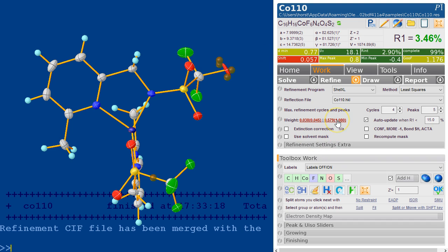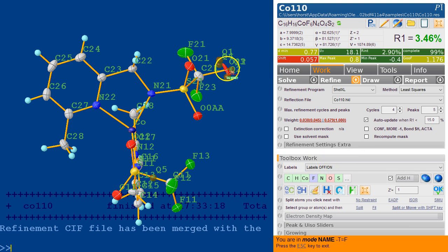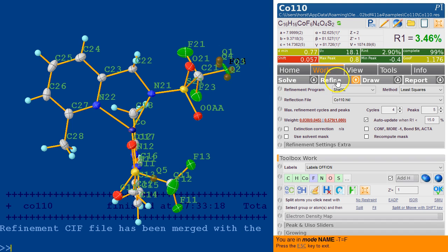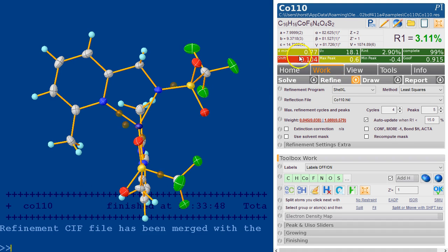There's no need to copy RES to INS. Also notice there isn't any need to edit any files at all. Really Olex 2 is designed to not having to edit any files. Let's just make this back into fluorine, pick up the fluorine, click on this. This makes it a fluorine and refine this again. And we should be back.